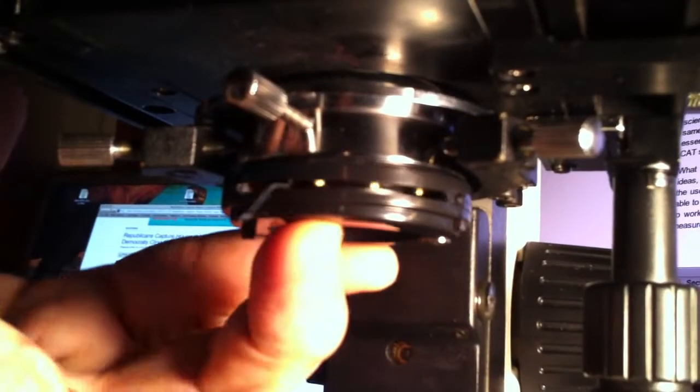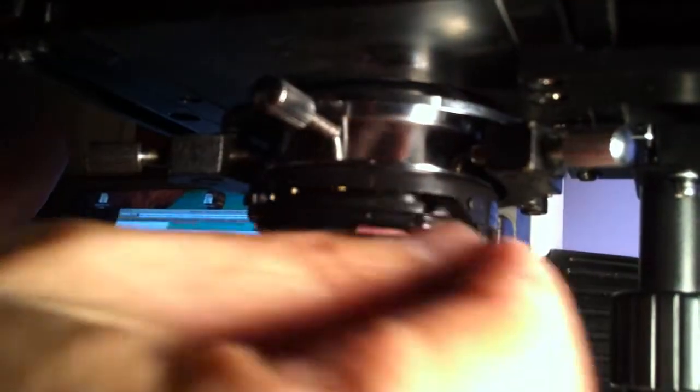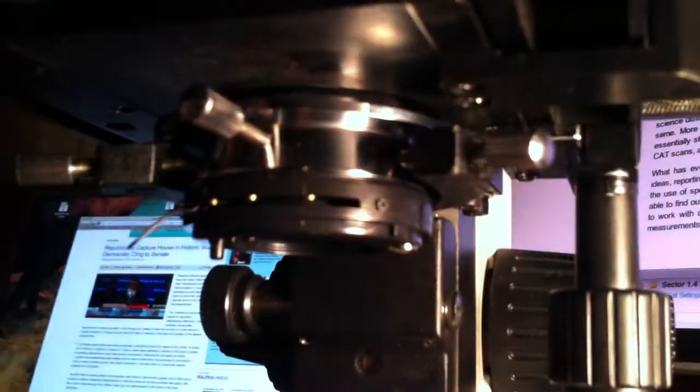One way or the other, here's how you put the sub-stage condenser back in. Make sure that your iris diaphragm lever is in the front so you can touch it and you can operate it. And then just simply tighten the screw. So now we've put the sub-stage condenser back in place.